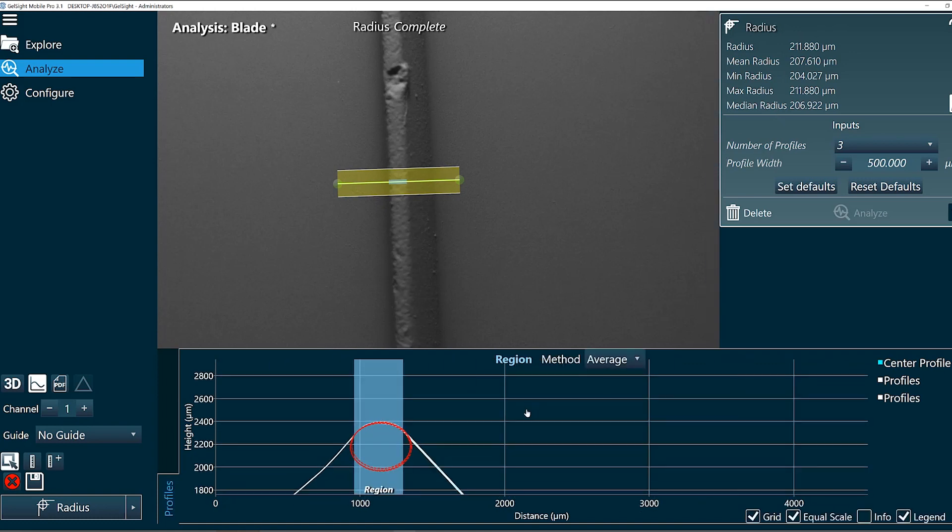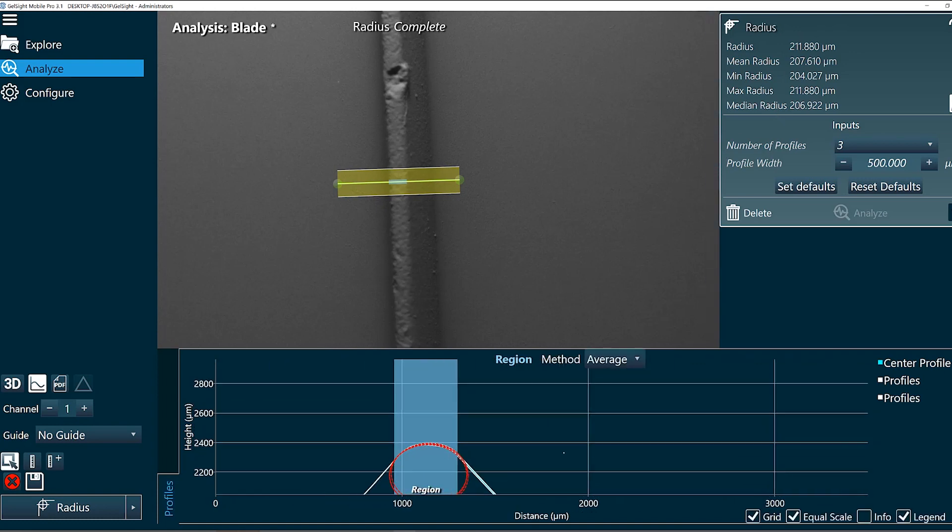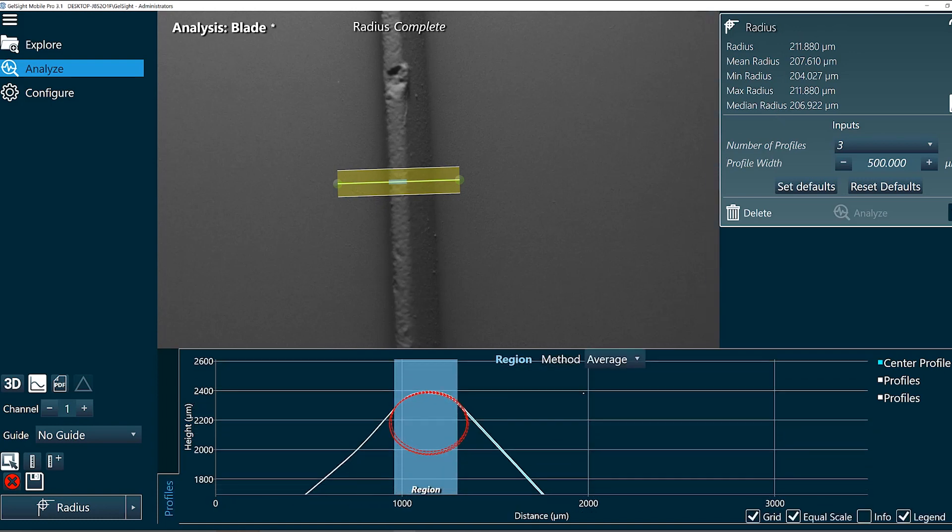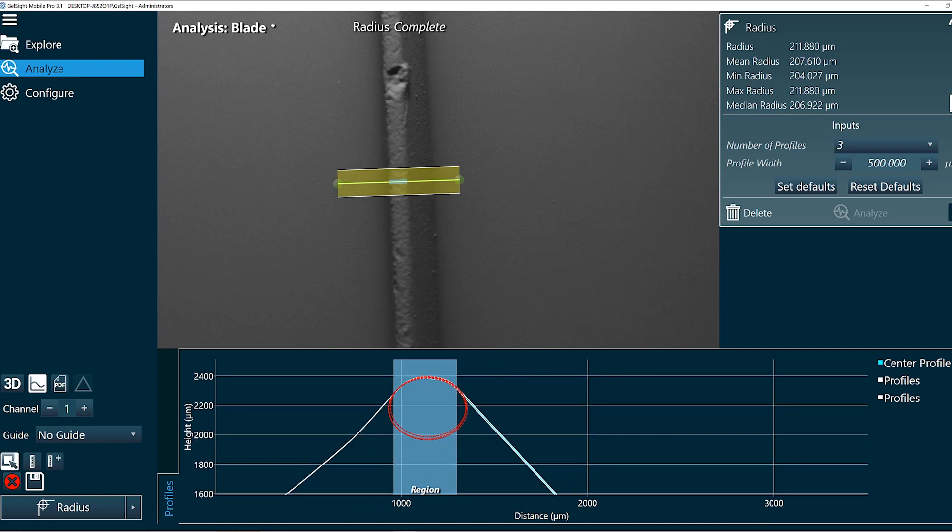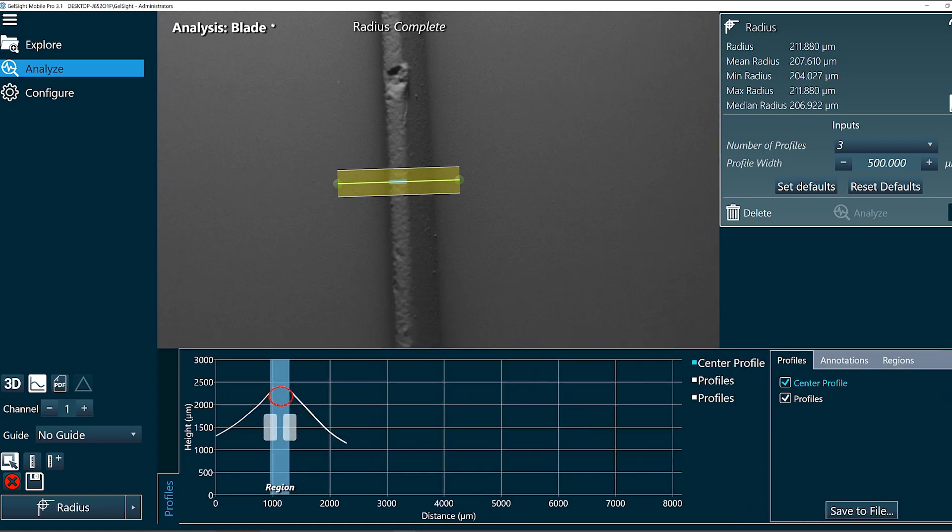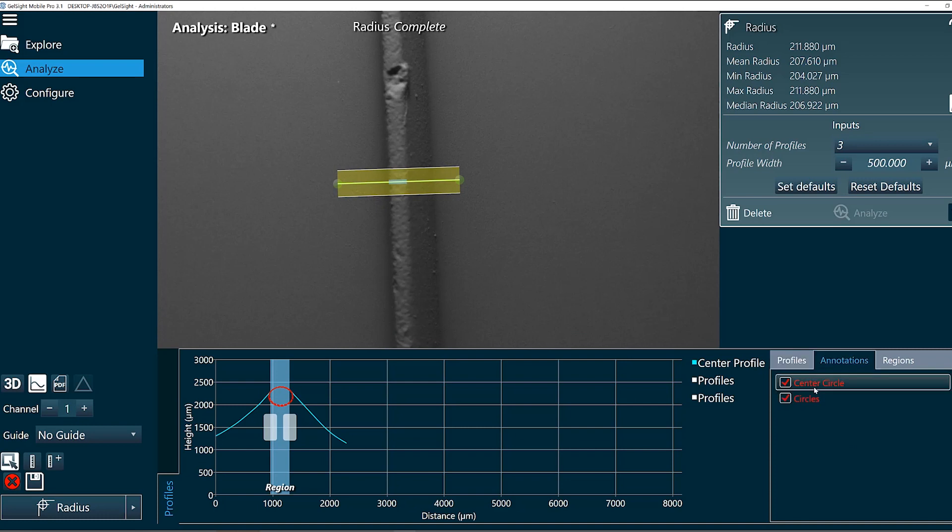I'll zoom in on my graph and I can see the plots of the profiles as well as the curves being fit. With this options window in the corner here I can enable or disable the view of other profiles.